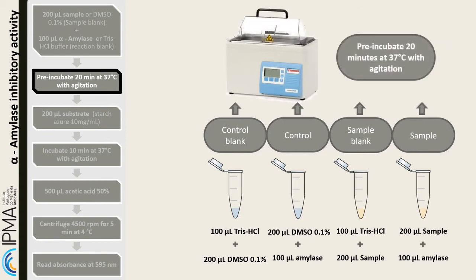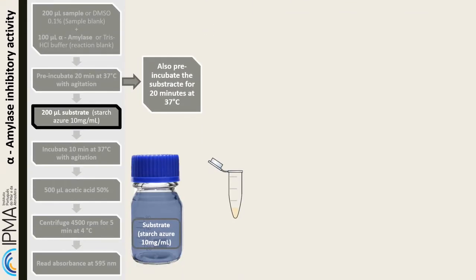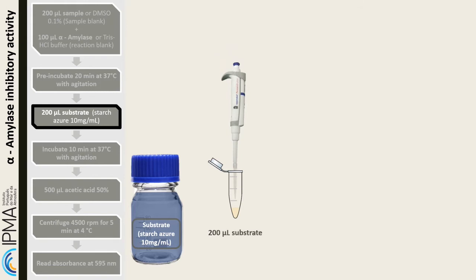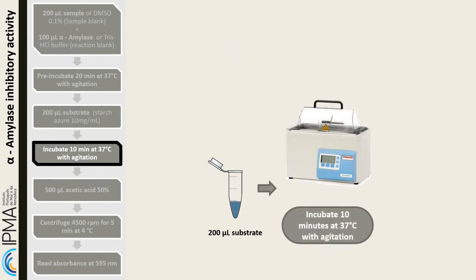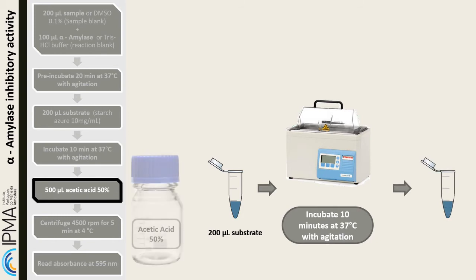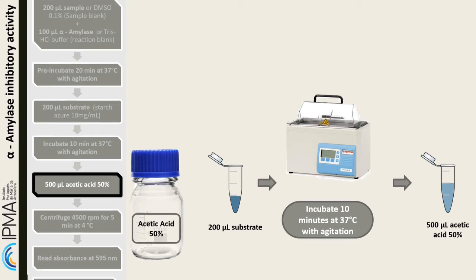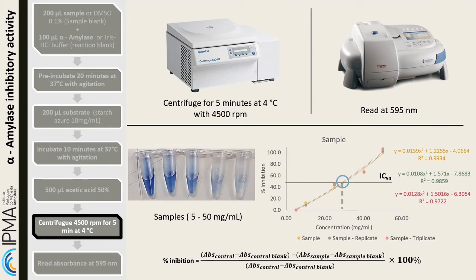Also incubate the substrate starch azure to bring it to 37 degrees before adding it. Add 200 microliters of starch azure and incubate for 10 minutes at 37 degrees Celsius with agitation. After incubation, stop the reaction by adding 500 microliters of acetic acid 50 percent. Then centrifuge at 4500 rpm for 5 minutes at 4 degrees Celsius, and read the samples at 595 nanometers.